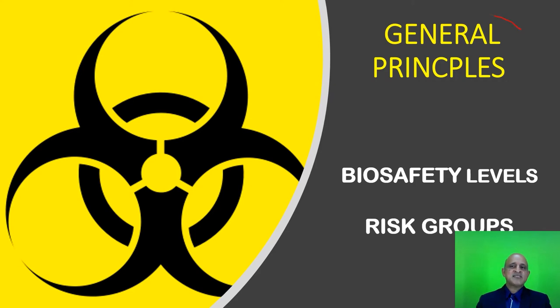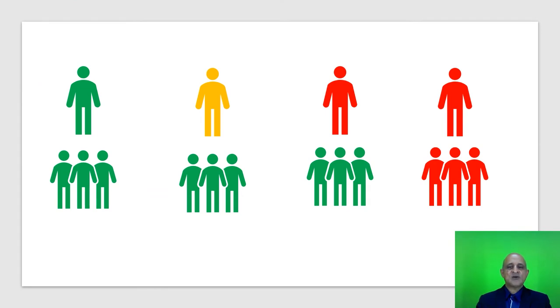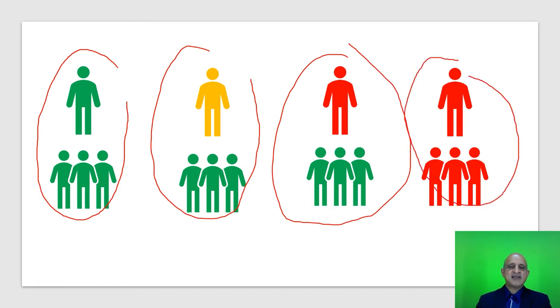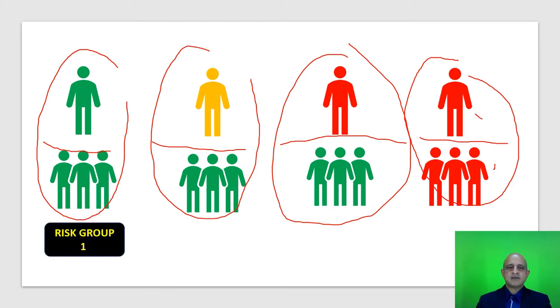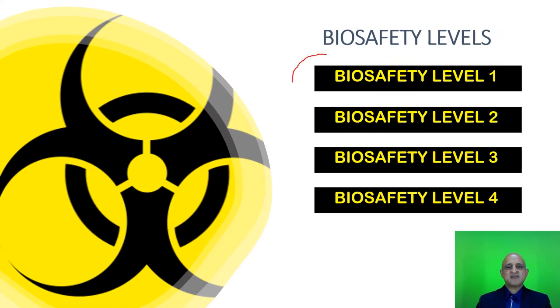The manual commences with what are termed general principles, which include biosafety levels and risk groups. Risk groups have been discussed in the earlier lecture on biological agents. We have risk groups 1, 2, 3, and 4, categorized based on their impact on the individual as well as on the community. The WHO also specifies four biosafety levels, which we will delve into in detail during the course of this lecture.